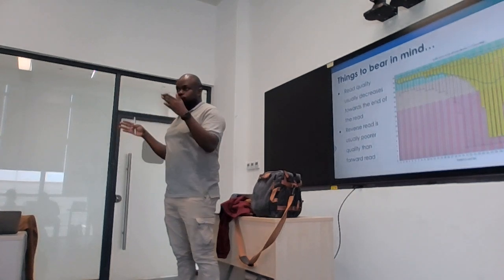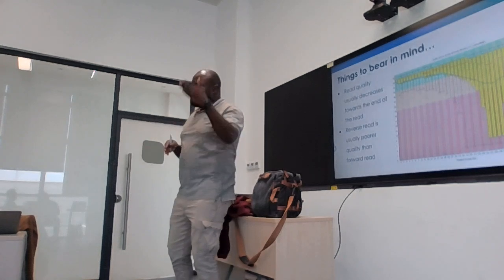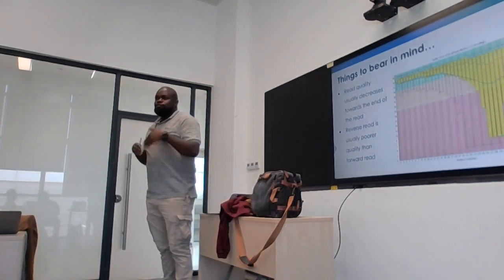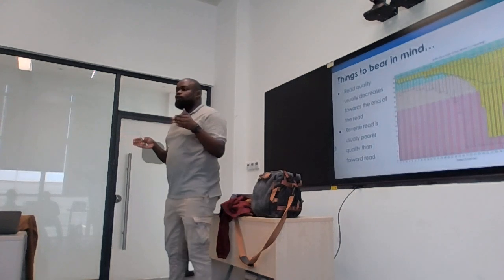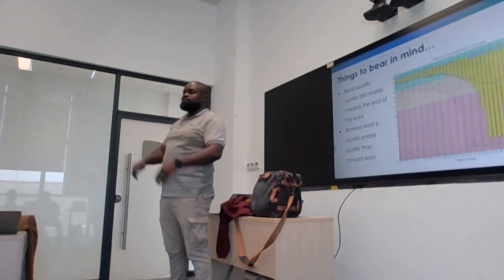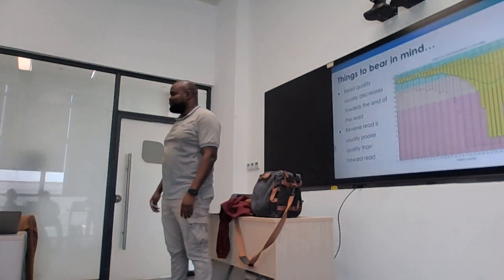Okay, let's work with 151. Let's say you continue trimming, but you also have to think about your minimum read length. Because what if you trim and you only get above 30 when you have 10 bases? Is that useful?